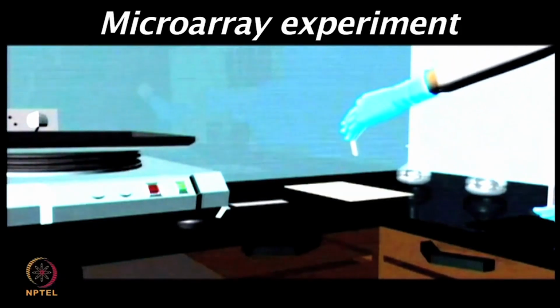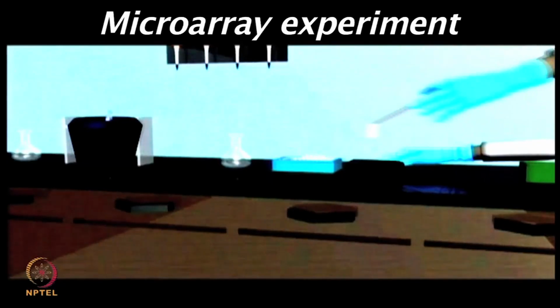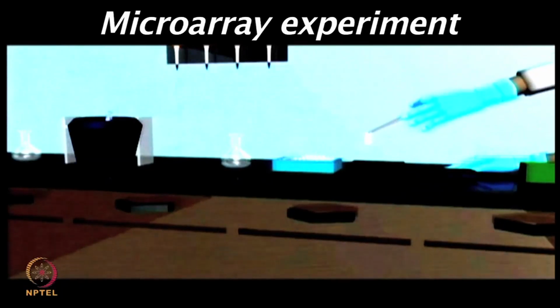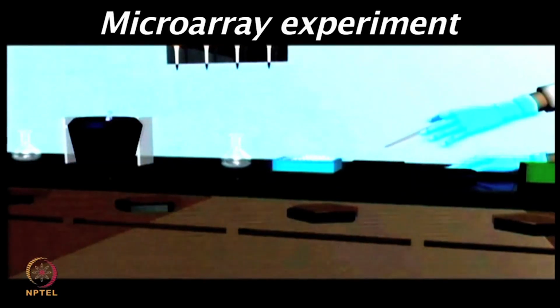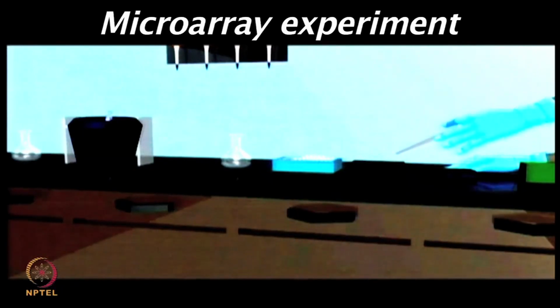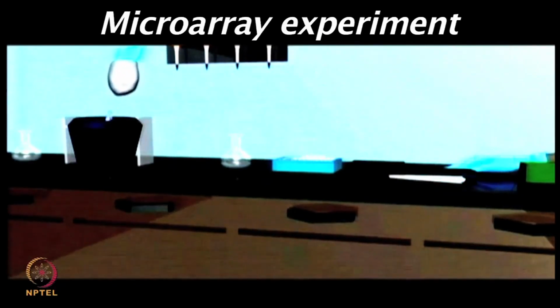Now, in a typical microarray experiment, as I mentioned, regardless of your application, one needs to perform a certain set of steps which are quite generic, and then depending upon the requirement, one can make changes and optimize the conditions for those experiments. So, a typical experiment includes a primary antibody, where one can use anti-query proteins if you are looking for protein-protein interaction, or one can add the patient serum, which we are going to show you in this one, for the immune response detection.